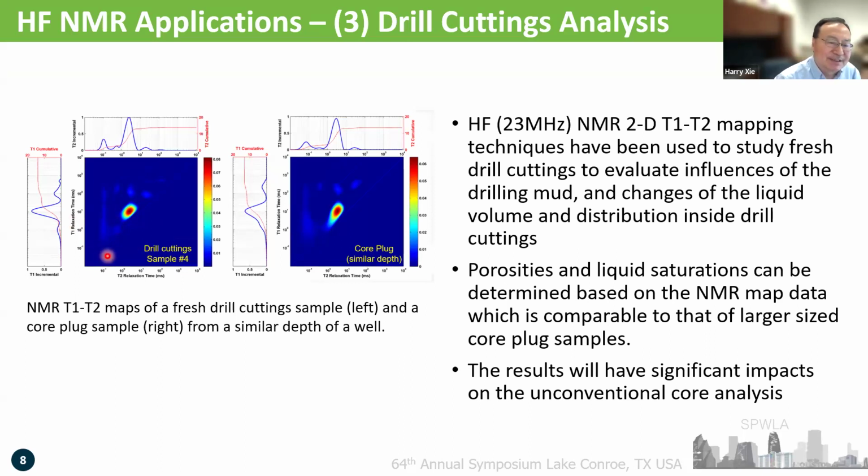So what is this data used for? We can compare it to the plug data. This is a similar depth, from the same well. You can see the signal shape and the saturation may be similar. That gives us the opportunity to make use of the cuttings, because cuttings are almost free of charge. So you can use cuttings to do a lot of work.